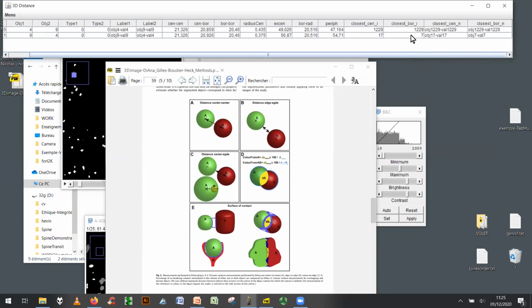So yeah, any question, or do you want to focus on something else? Or maybe just 2 to 3 minutes. Nicolas, do you want to explain the different distances and things? Yes, it was just because I saw in the table. You explained very well, but it's sometimes easier with one single picture. Yeah. So with 3D Manager, you can really measure different kinds of distances.